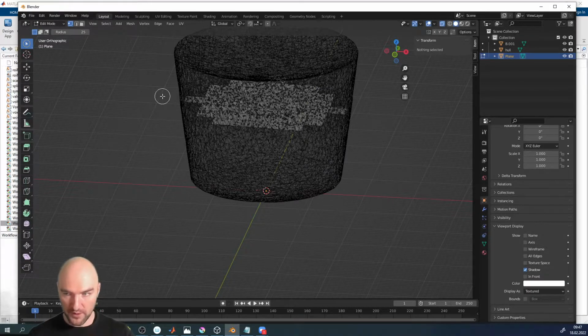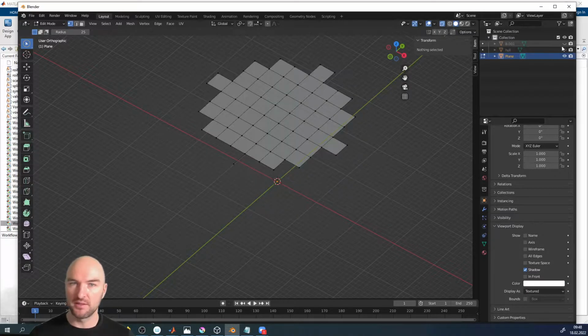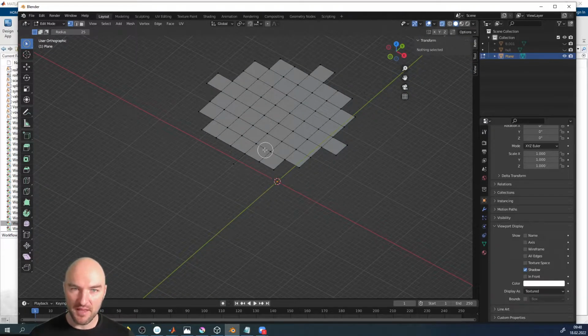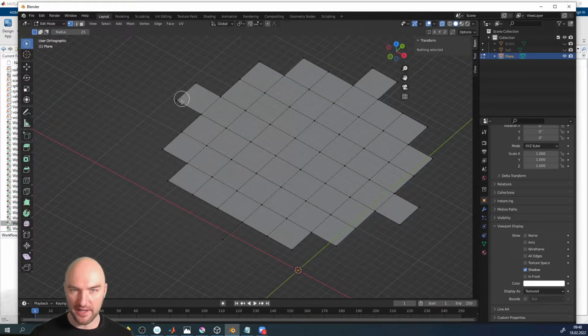You can do all of that manually, by the way, but I will show you how to do it programmatically, because that might save you a fair bit of time. So the first thing I'm going to do is switch all of those things off. Here we've got one vertex that's very lonely. What we are now doing is creating a mesh topology that we can fit to the boundary much more easily.